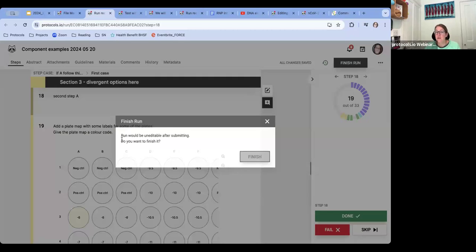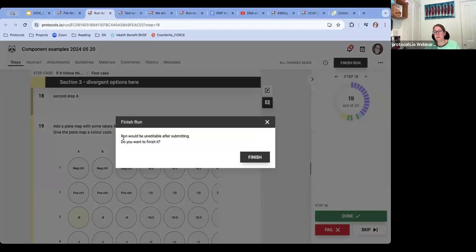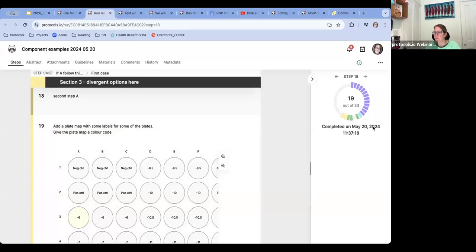Save. Finish. Run will now be uneditable after submitting. Do you want to finish it? I could stop and just leave it as partial still, and that would be fine. But I'll say finish this time. Now it's got completed and it now has the date timestamp on it.